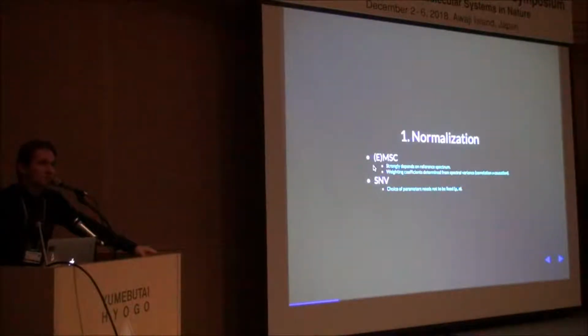So even in the simplest case, SNV being the simplest pre-processing technique that I know of, there is still a lot of room for improvement.